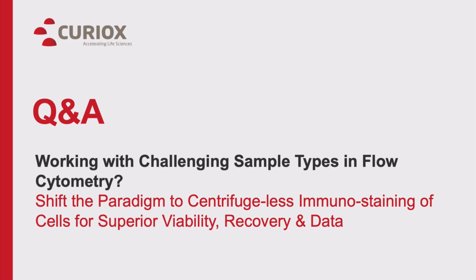For intracellular staining, fixation and permeabilization steps can be performed directly in the plate as done for incubation with antibodies? Correct. So when you're permeabilizing cells and you're going intracellularly, again, your settling times might be a little bit longer than 30 minutes, because remember, you're punching holes in these cells and they're basically becoming wiffle balls. So they kind of like to bounce around in solution a little bit longer. This even goes for centrifugation steps. So you might have to give them a little bit longer time to settle down to the plate just because they're a little bit more buoyant because they've had holes poked into them.